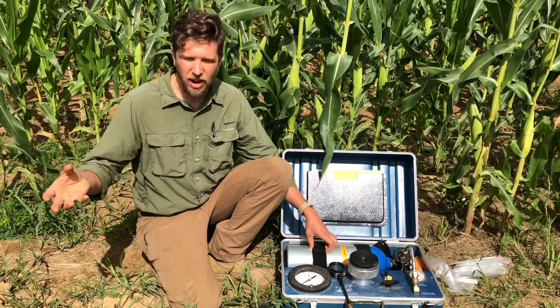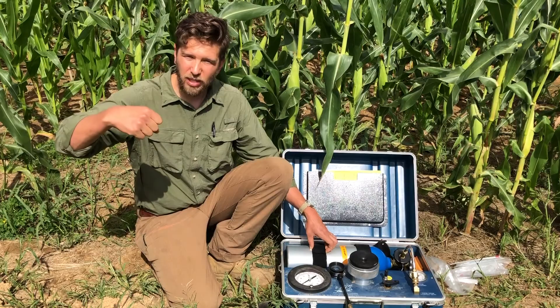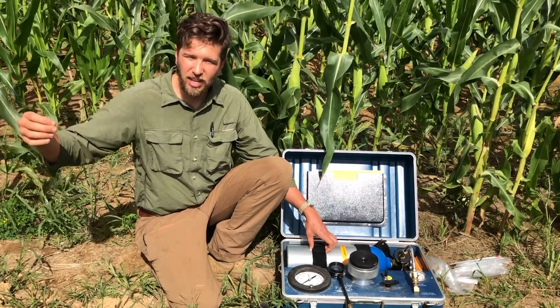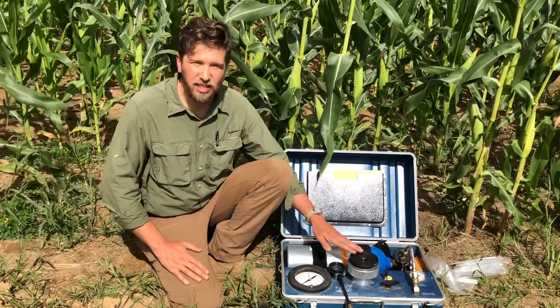As water is transpired out of these leaves and lost as photosynthesis occurs, water needs to be continually pulled out of the soil, through the xylem vessels in the roots, in the stems, and in the leaves, and then eventually out of the leaves. So this negative tension that exists throughout the entire plant can be measured using this device.